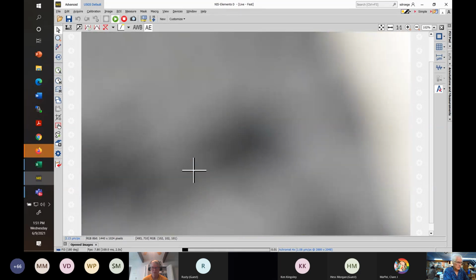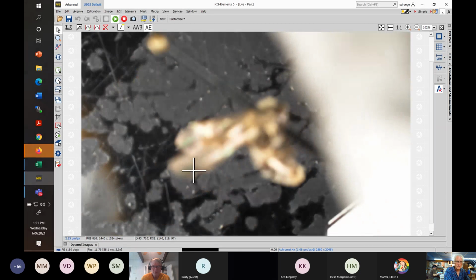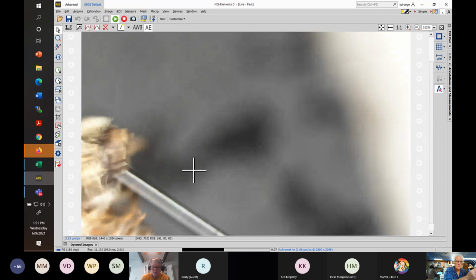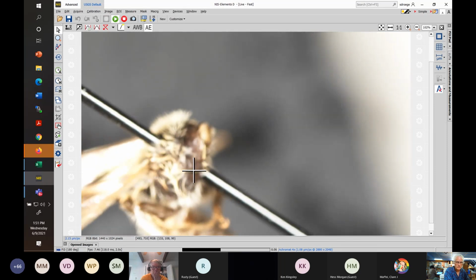Okay, I'm now going to take the head off the specimen, if I can do that without any other problems. And we'll see the pronotum. Oh, it came off. Okay, now theoretically, when we go to the specimen, get a little bit better view, we'll be able to see the pronotum again. And I'm going to zoom up here and see the state of not having corners.